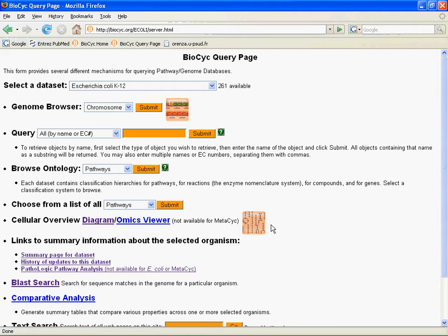The purpose of the omics viewer is to provide an intuitive visual display of large data sets. It allows the identification of concerted changes in pathways and whole sections of the metabolic network. It can support data from expression, proteomics, metabolomics, and pretty much anything in which a number is attached to genes, proteins, reactions, or metabolites. We also have omics viewers — available right now only on the desktop version, but soon on the web version — that will let you display omics data on the whole genome and on the genetic regulatory network. We'll be talking about those in a future webinar.